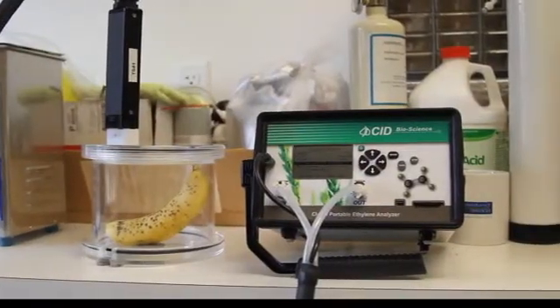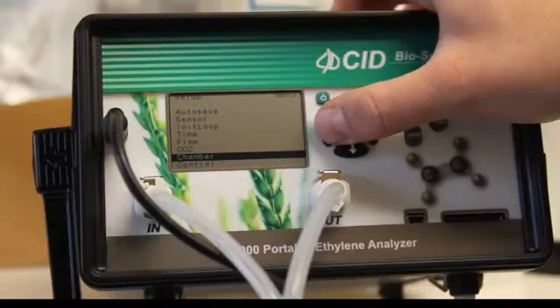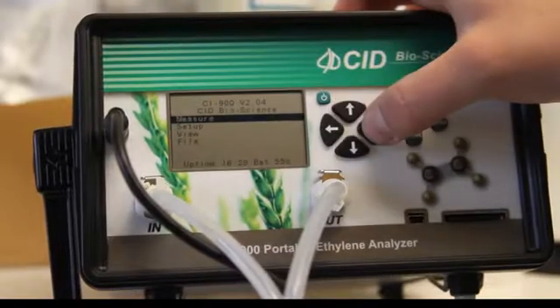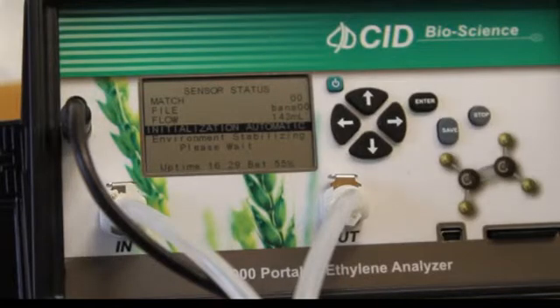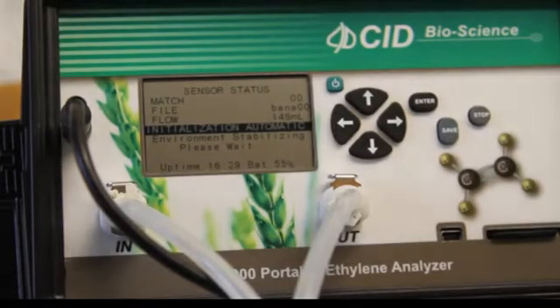Next we run a new initial loop for these new environmental conditions. To do this, we go back to the main menu and select measure. As you can see in the rear of the CI900, it is bubbling. This initial loop will as before run for about 3 minutes before it gets close to 100 consistent data points.